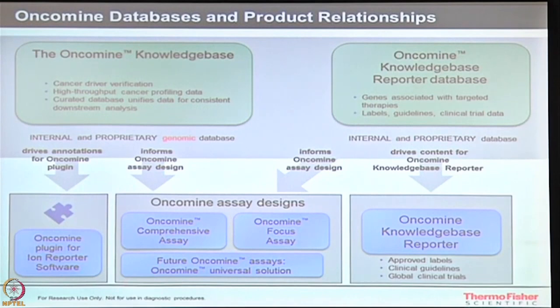What I was talking about earlier in AmpliSeq is that I would like to design my gene assays or gene regions, targets of interest, and then sequence them to know which diagnostic variants you are getting. The same thing is coming over here.